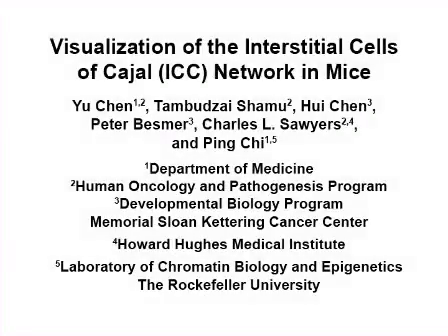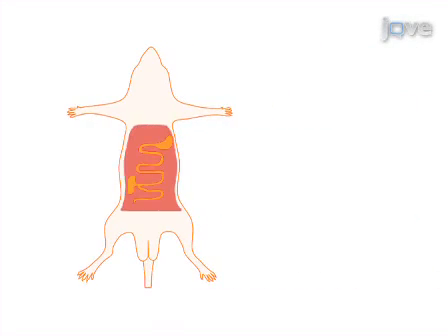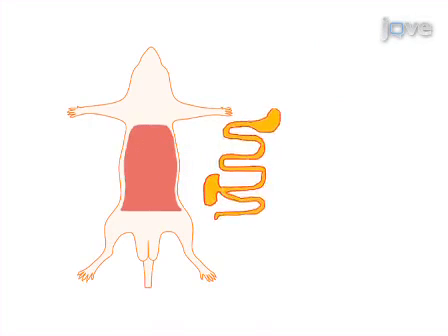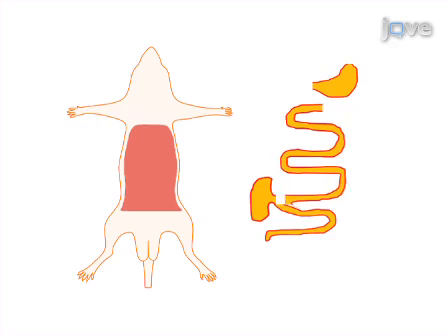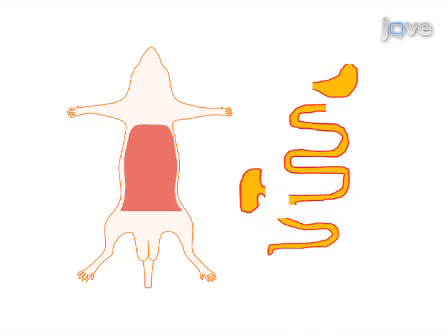The overall goal of this procedure is to visualize ICC networks of the mouse GI tract. This is accomplished by first dissecting and isolating the entire GI tract and separating it into the stomach, small intestine, cecum, and large intestine.